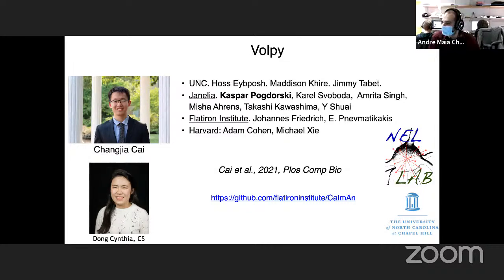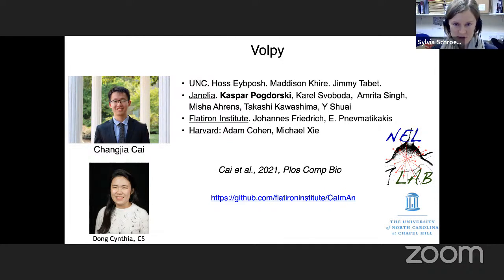Thank you for that. We have a question from Sylvia. Do you want to ask it yourself, Sylvia? Sure, I can do that. I'm using Suite2P so far and wanted to ask you what the difference is. I don't really know the details, but it looked relatively similar. Is there any reason we should switch to CaImAn? I haven't heard about this new thing that you were saying about looking at the activity during the experiments. That sounds very interesting. But in the post-processing, what do you think?